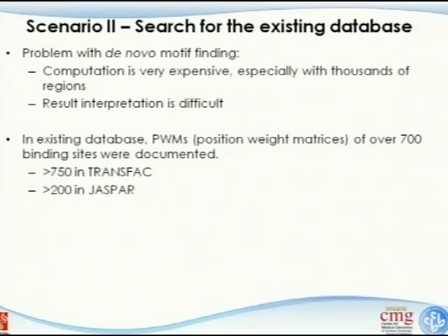Let me give you a little bit of resource regarding the existing databases, what the data will look like. The position weight matrices, those matrices I just showed you, of over 700 binding sites are documented in the Transfac database. And there are over 200 in the Jaspar database.